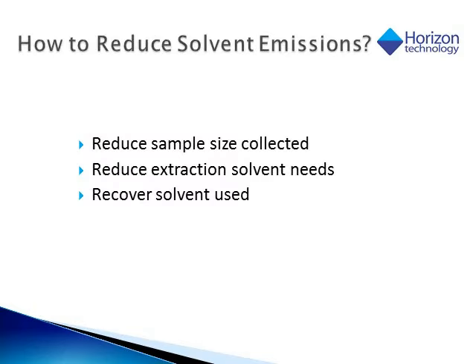How to reduce solvent emissions? There are 3 ways. Reduce the sample size collected, reduce the extraction solvent needs, and recover solvent used.